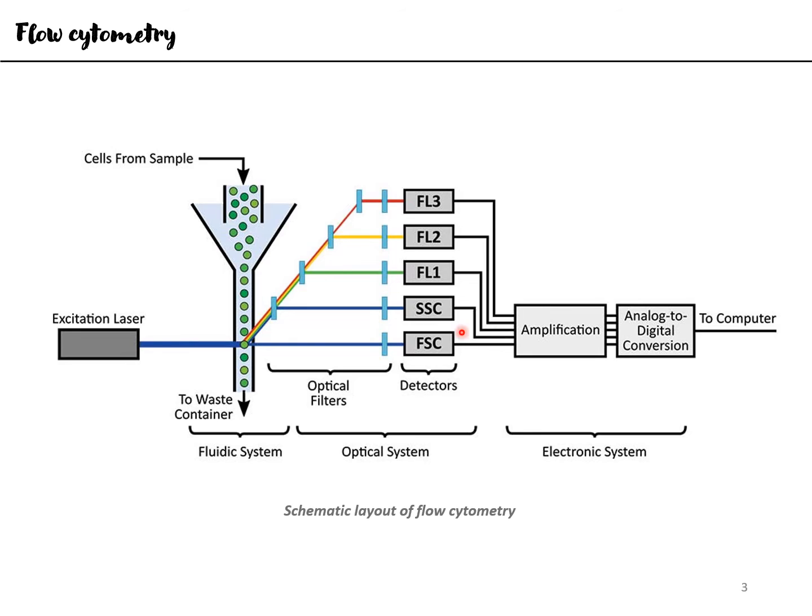Okay, so we have in this particular schematic three different fluorescence detectors. Now this is the SSC detector, which is the side scatter detector, and this essentially measures scatter at a 90-degree angle relative to the laser. So this is roughly 90 degrees. Well, it might not really be clear in this particular schematic, but this is the second detector that we were talking about, which is placed roughly at 90 degrees.